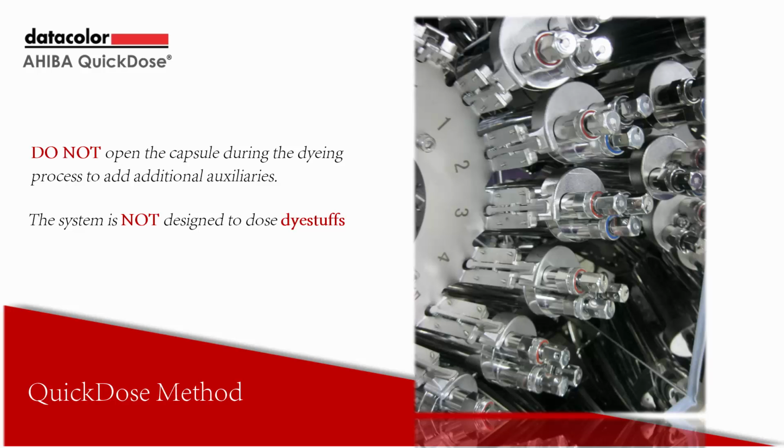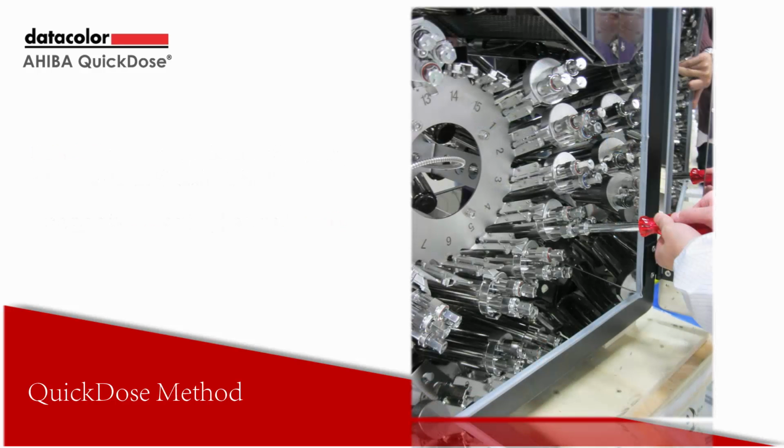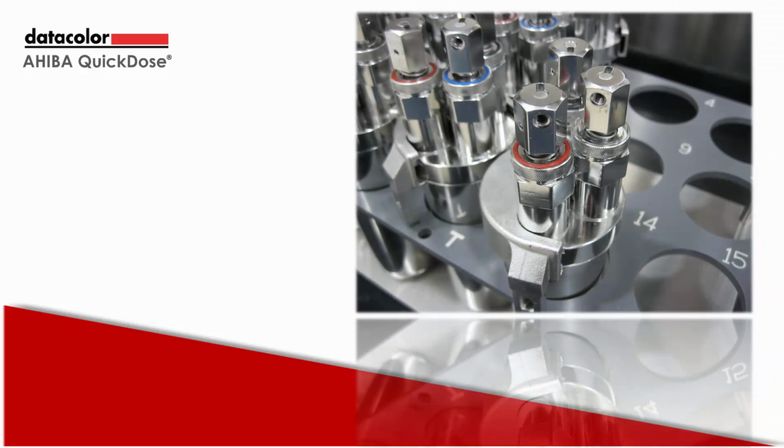Once the step in the process is reached where dosing is required, the operator will open the door of the unit and, using the provided tool, will actuate the capsule cap. The cap is then locked in the open position and will remain open throughout the remainder of the process. There are color-coded O-rings on the capsule caps to help the operator know which capsules to turn at what time.